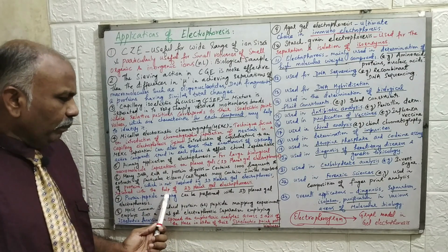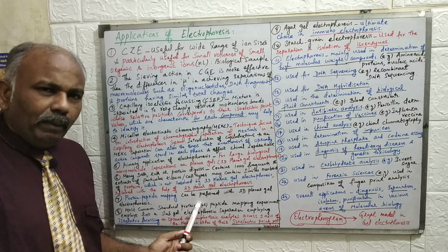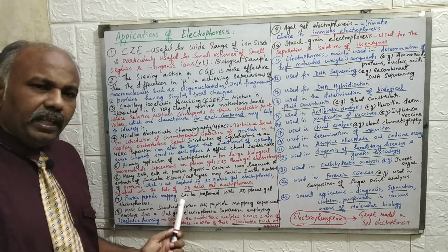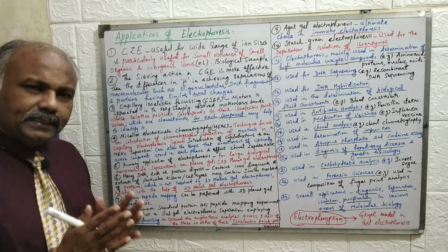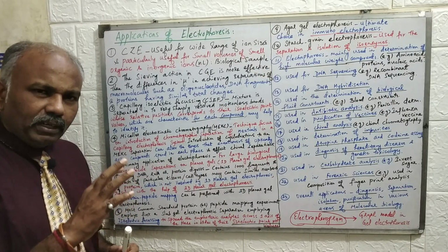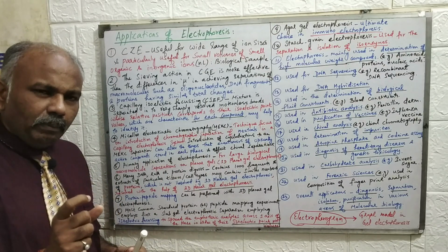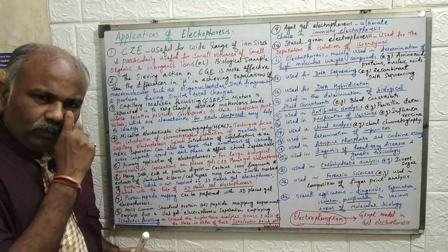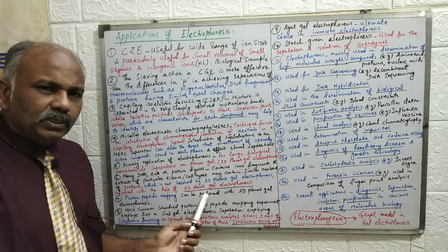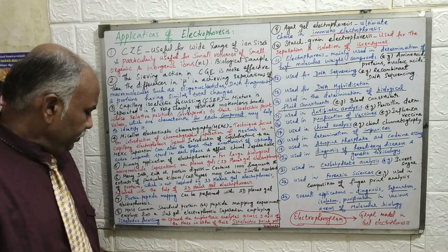The next important application is protein peptide mapping. What is this protein peptide mapping? This can be performed with two-dimensional planar gel electrophoresis. Again, we can perform the same technique with two-dimensional planar gel electrophoresis, just to have a contour plot where we can map the complete proteins and peptides in a single electrophoresis system slab, right? So here we can use protein peptide mapping. This is one of the very important techniques with two-dimensional electrophoresis.